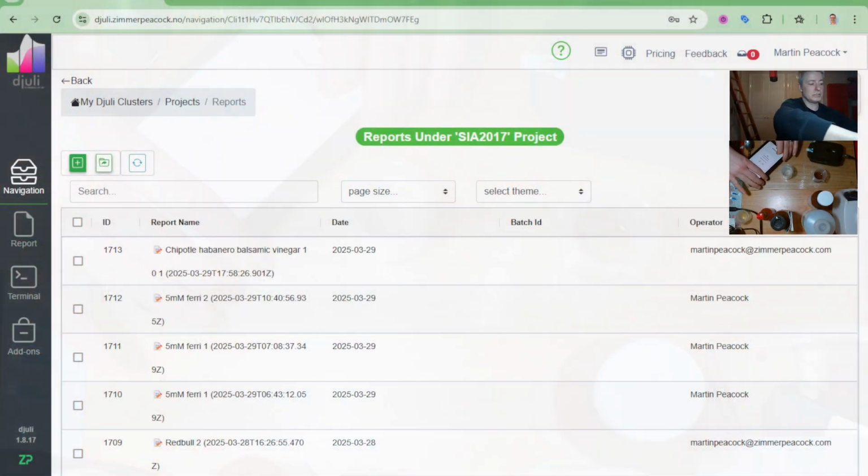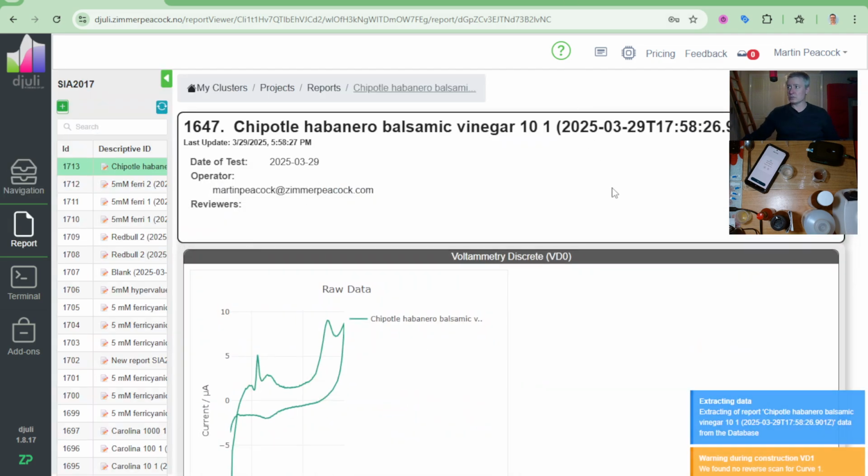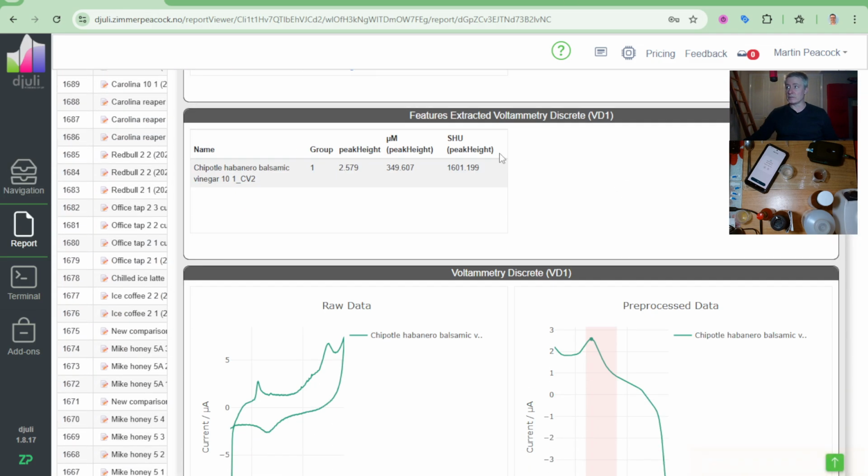In fact, I did an earlier test on this as well. I prepared an earlier sample just to do a dry run. So I did actually prepare two samples exactly the same way. Earlier on when I tested it, I got a result of, let's have a quick look. This was the earlier one. I just did a live one in front of you. Earlier on I got 1,601.